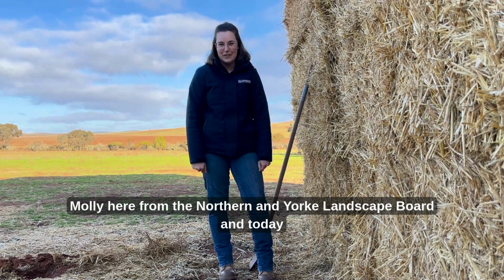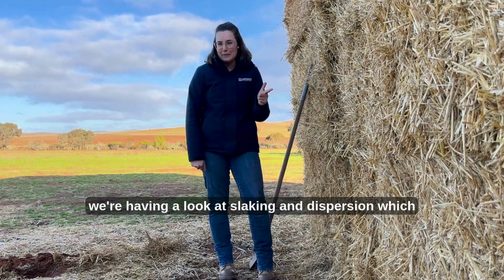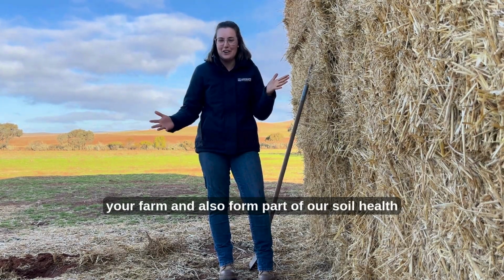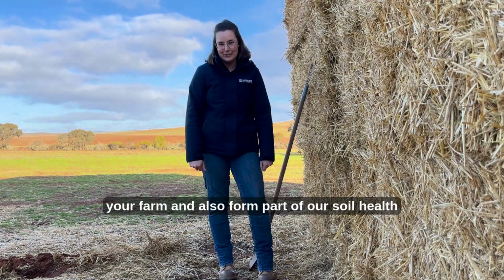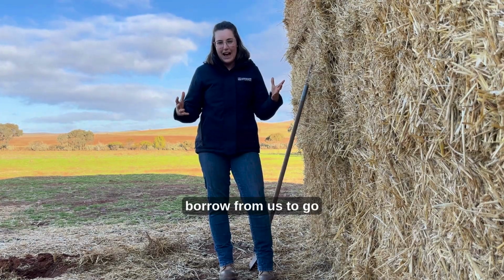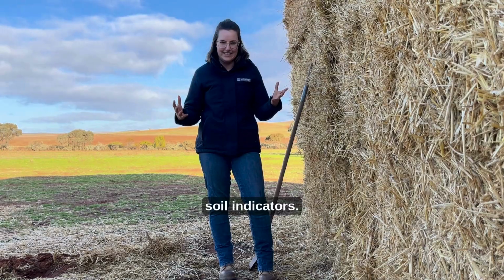Hi, Molly here from the Northern and Yorke Landscape Board, and today we're having a look at slaking and dispersion, which are two of the tests that you can do at home on your farm and also form part of our soil health toolkits, which are simple things that you can borrow from us to take back to your property and test some basic soil indicators.